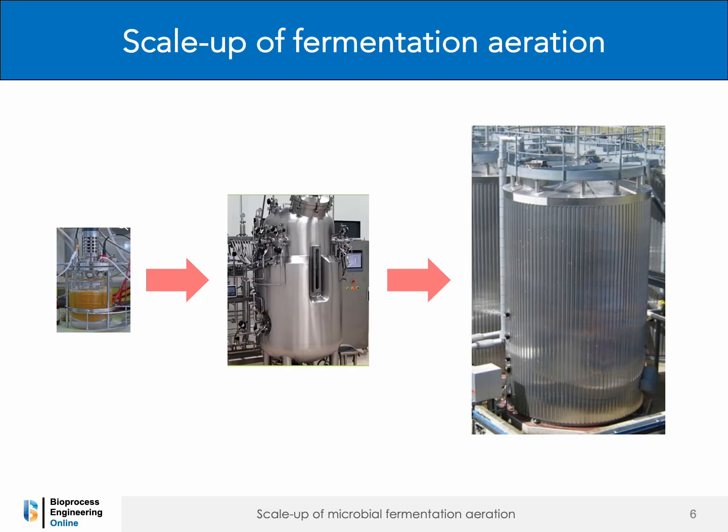Fermentation processes are typically developed and optimized at laboratory scale, using fermenters with working volumes of only a few liters. These processes are then progressively scaled up through pilot units to industrial fermenters, whose working volumes may range from tens to several thousands of cubic meters.